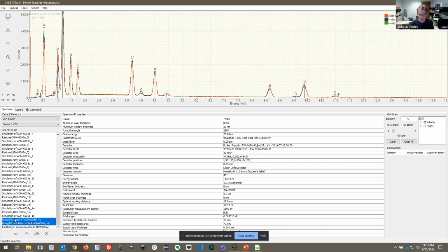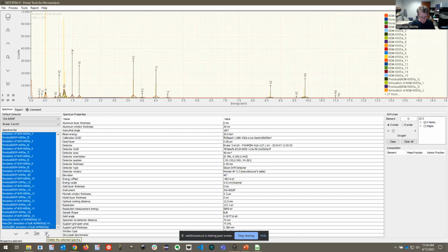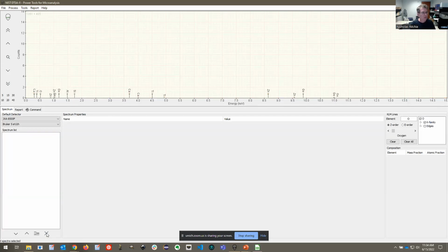You have a small inclusion and you wonder how it will differ from that same material in bulk. These are all questions you can answer by Monte Carlo simulation. So I'm going to get rid of these and move on to the next part of the talk.